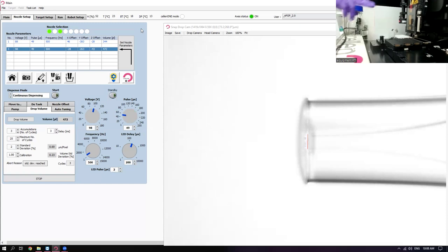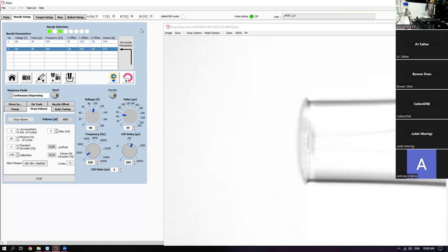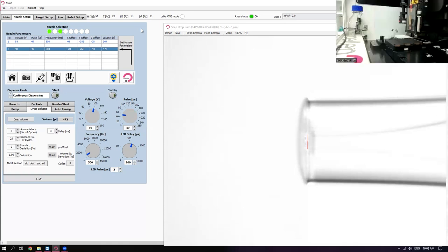We have two nozzles mounted here. We have this vertically mounted camera, which we use to do kind of QC of the process. So you can see that at the end of the day, all of these clusters got everything they needed, all of the reagents they needed in volumes that were expected. And we'll show you more of that as we go.